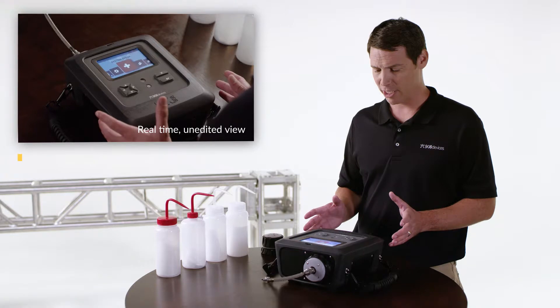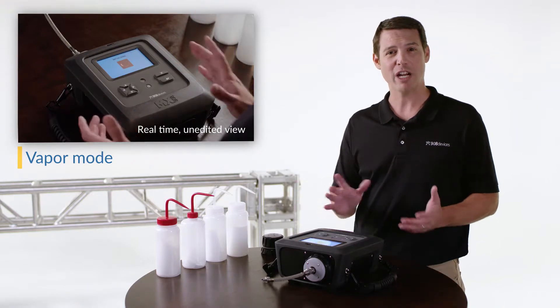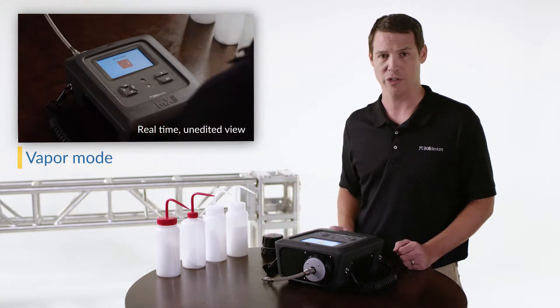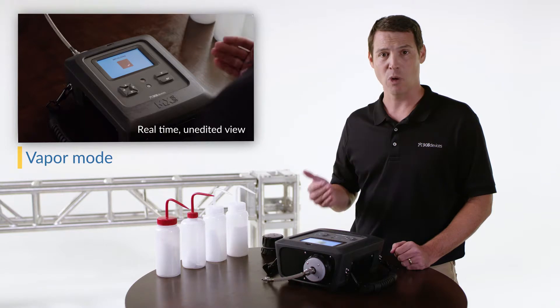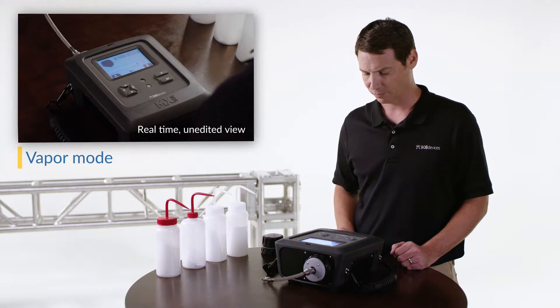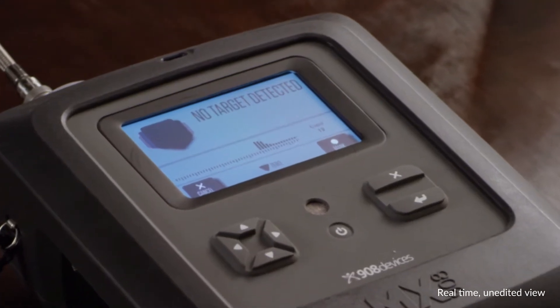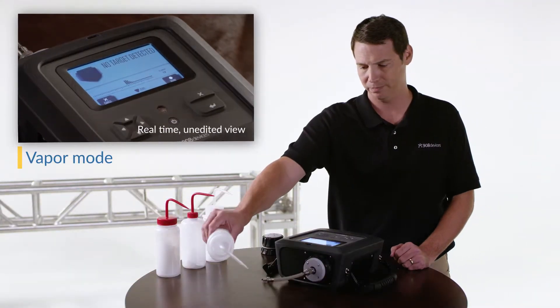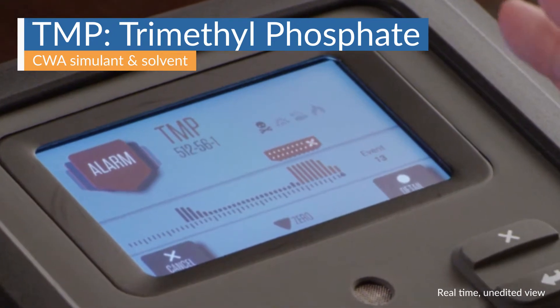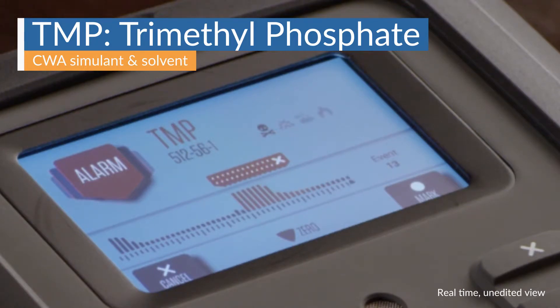In just a moment we'll be up and running. For most samples we recommend that operation begin in vapor mode, and I have my vapor module attached, so that's why we're going to start there. In less than 20 seconds we'll be running multiple analyses every second based on the air drawn in from the tip of the vapor probe. We're drawing in clean air and we've dropped down to a nice clean baseline — we're ready to introduce our sample. Here we see the signal bar intensity increase and we got a clear alarm for TMP. As clean air is being drawn in, we're back down to our baseline.